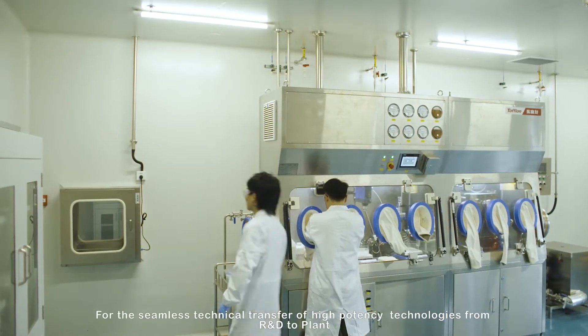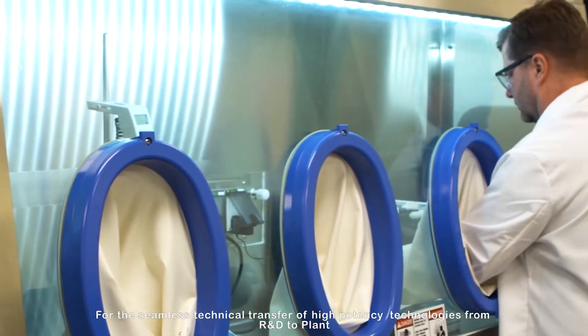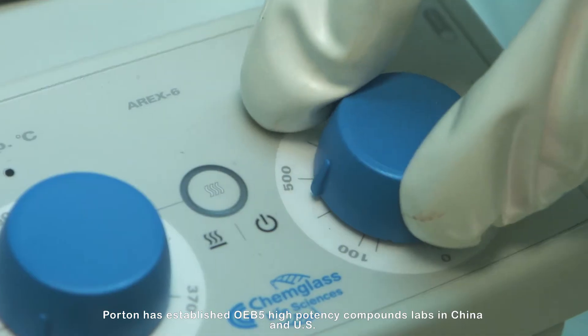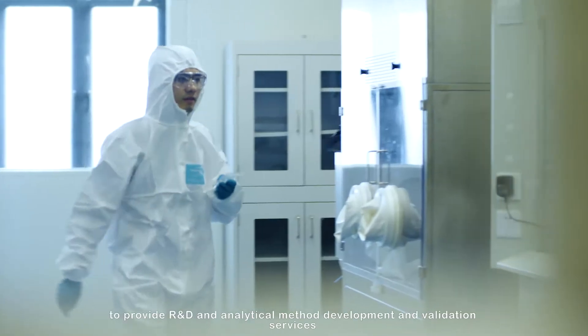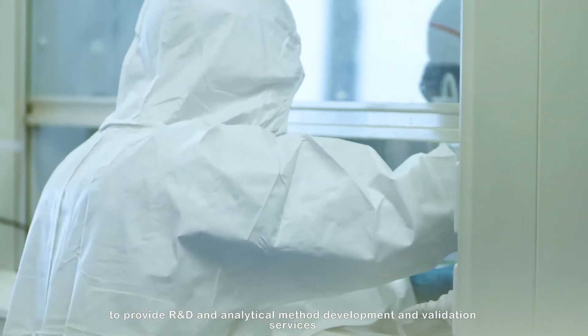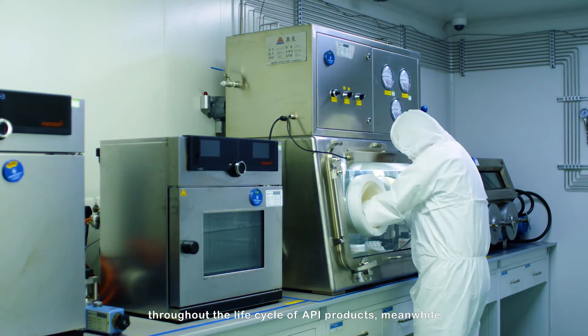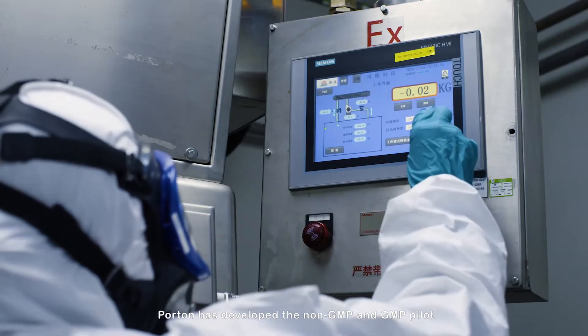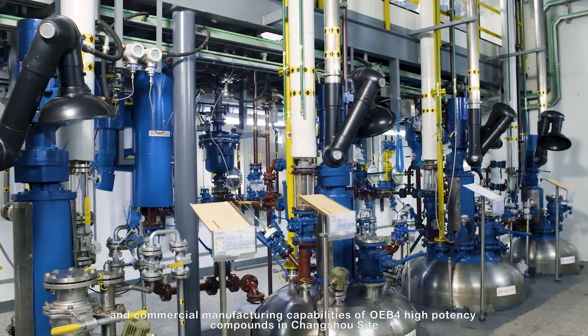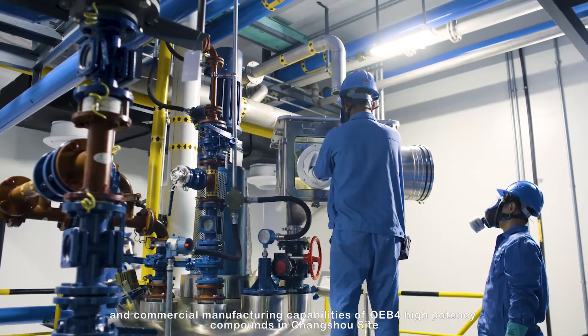For the seamless technical transfer of high potency technologies from R&D to plant, Porton has established OEB5 high potency compounds labs in China and US to provide R&D and analytical method development and validation services throughout the life cycle of API products. Meanwhile, Porton has developed a non-GMP and GMP pilot and commercial manufacturing capabilities of OEB4 high potency compounds in Changshou site.